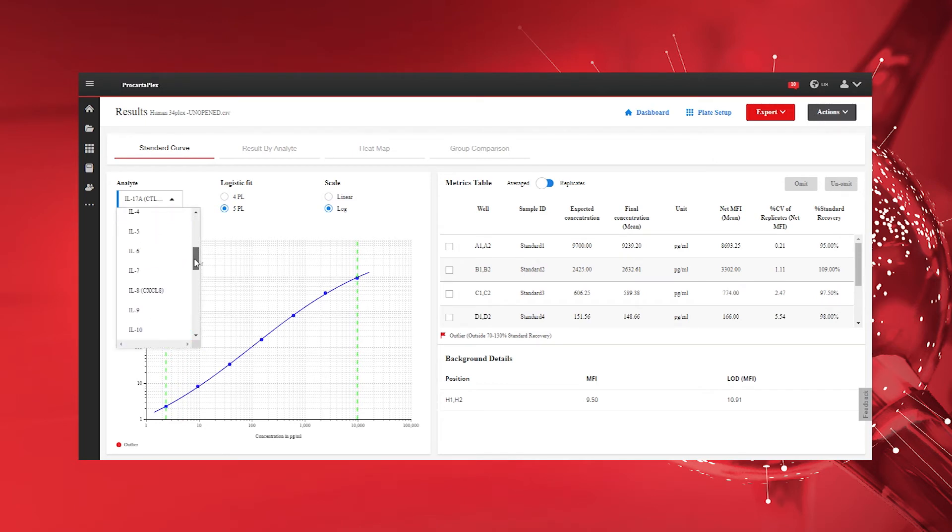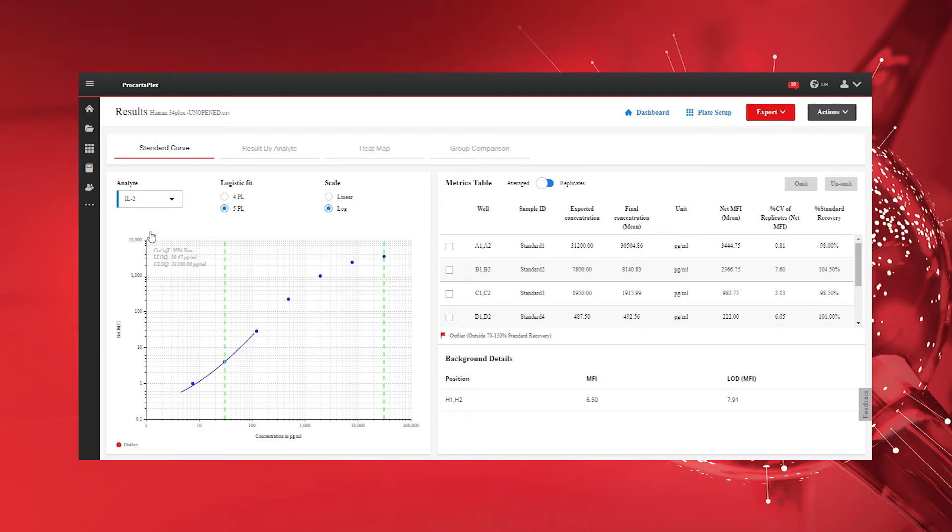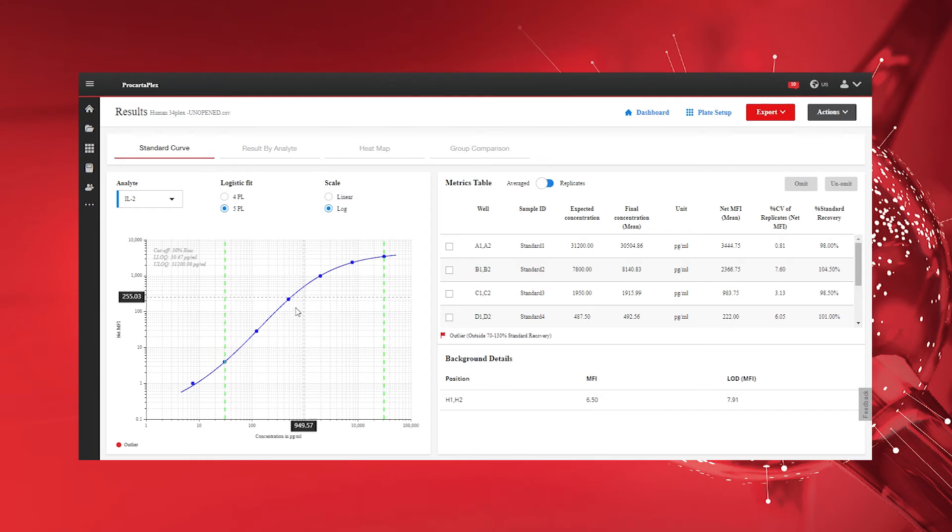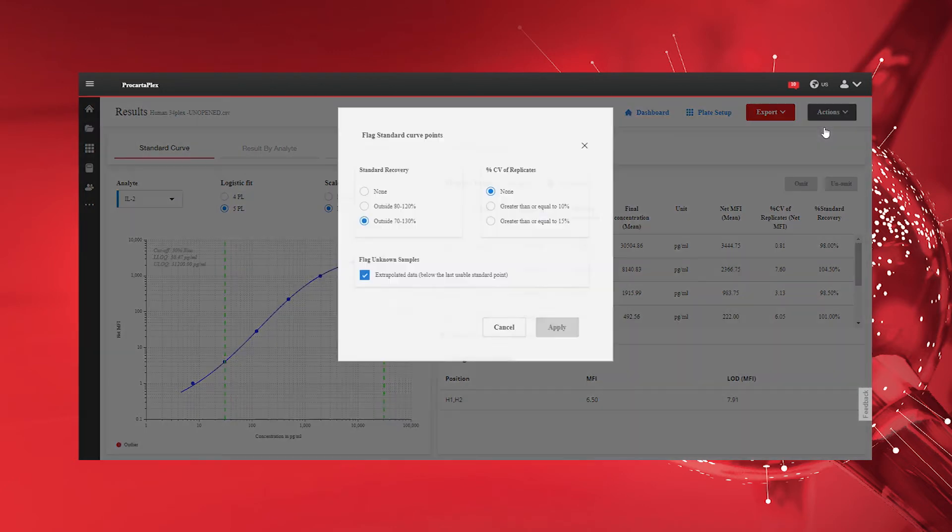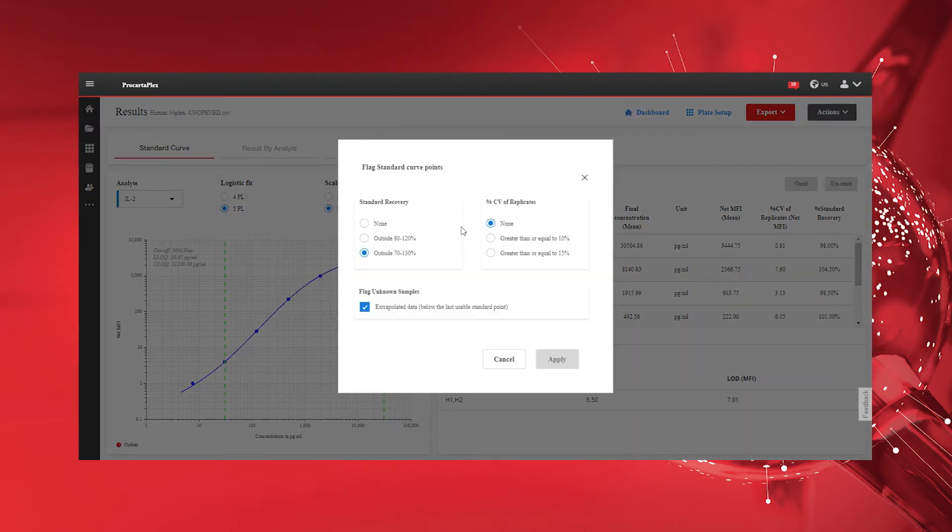By default, outliers outside the 30% standard recovery range will be marked with a red flag in the Standard Curve Metrics table. Modify these settings by accessing the Set Flagging Parameters option under the Actions button.